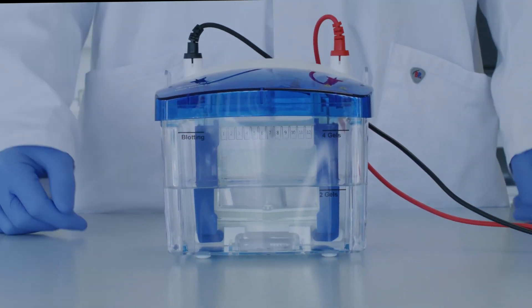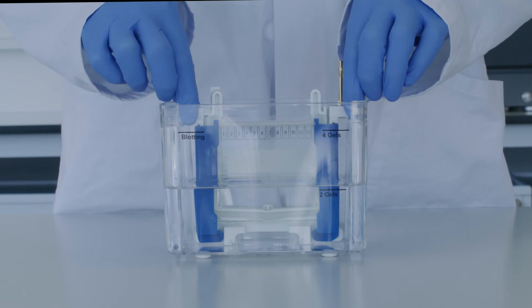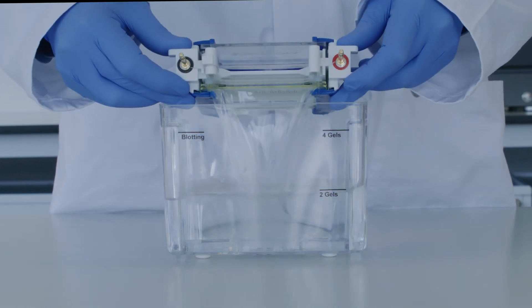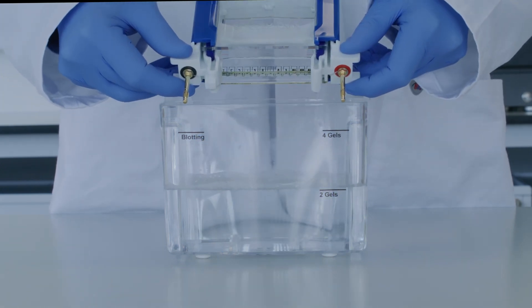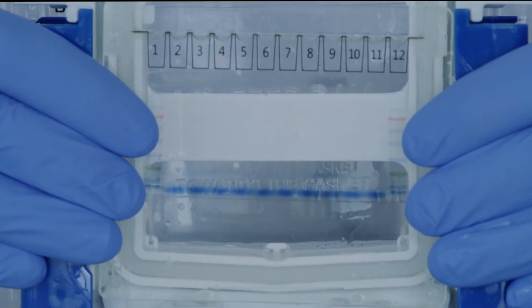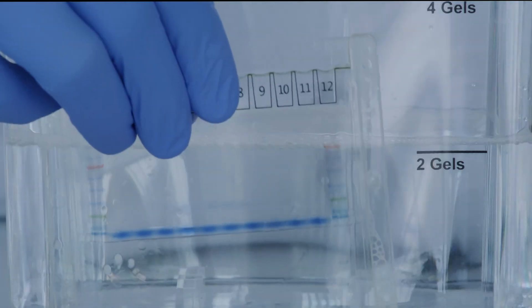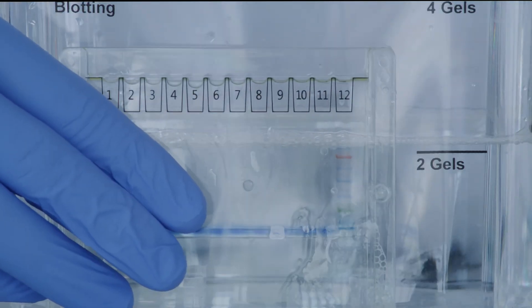Lift up the inner electrophoresis chamber and pour out the running buffer. Slide the side clip fasteners open and remove the GIL cassettes. You can now remove the GIL from the GIL cassette and continue with the next application, such as Coomassie staining or Western blotting.